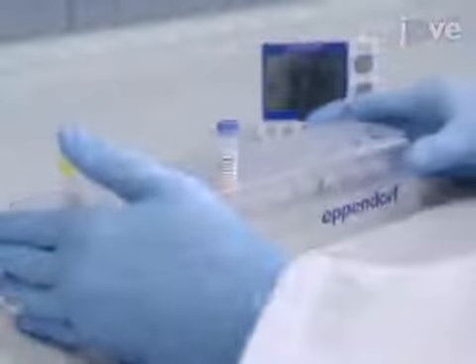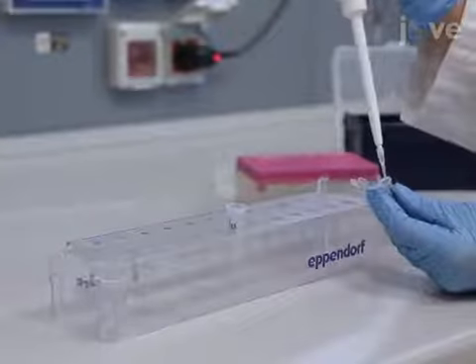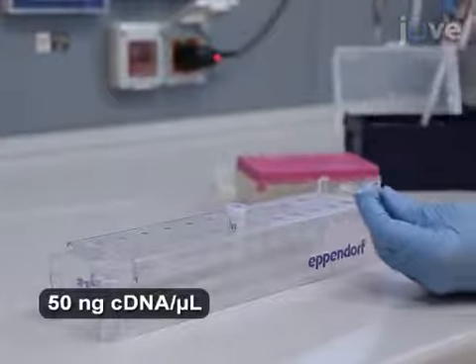To begin, let the master mix and the assay thaw at room temperature for at least 20 minutes. Then, load 0.5 milliliter tubes with 6 microliter aliquots of the cDNA samples.